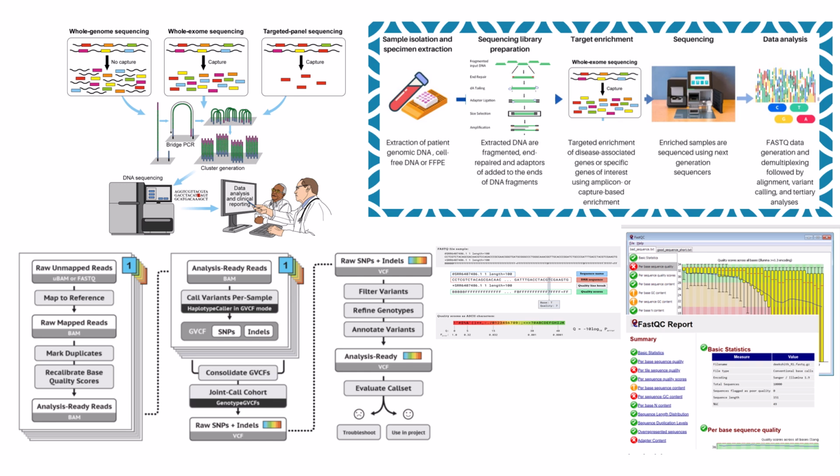But the core of this phase is applying stringent quality filters, often called hard filtering, using tools like GATK's VariantFiltration. This is where you apply a set of predefined rules or thresholds based on various quality metrics associated with each variant call. And tricks, like what sort of things? Things like QD, which is quality by depth. How good is the call relative to how many reads cover it?